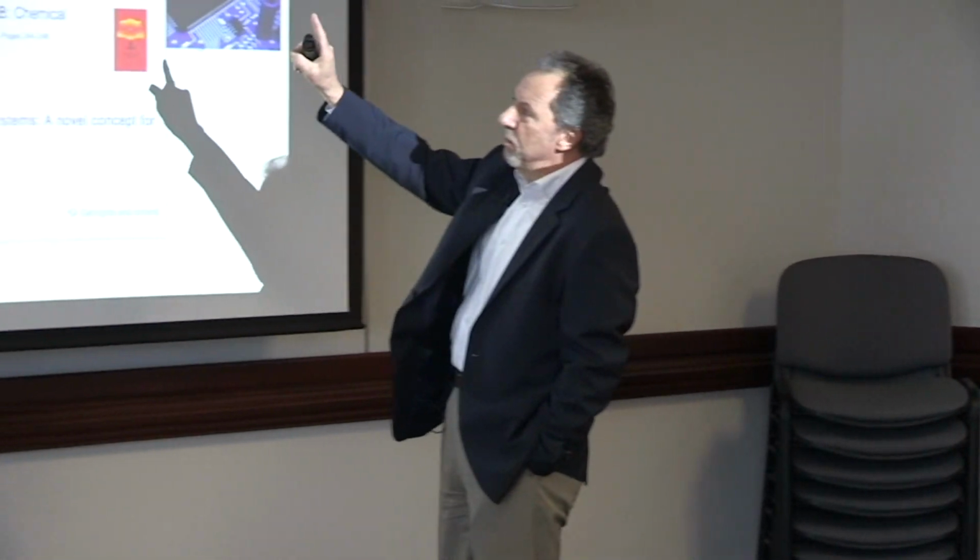So lab on a chip is not this. But in 1988, Andreas Manz essentially suggested that if we take a glass microscope slide and etch a channel in it and cover it with another glass microscope slide, we can create a microfluidic channel that allows us to do chemistry. So this idea has been around for an awful long time.